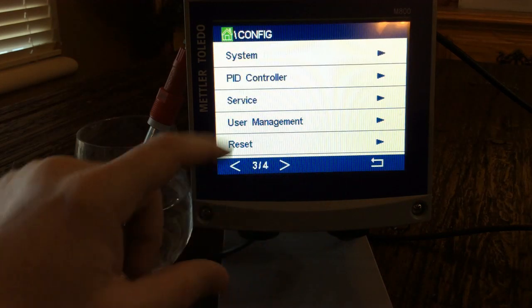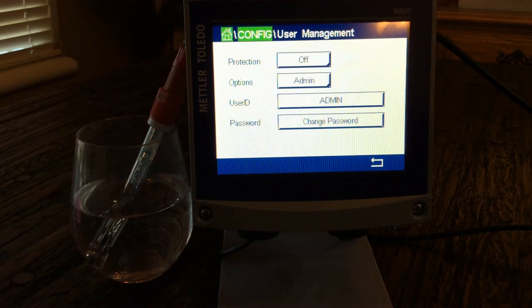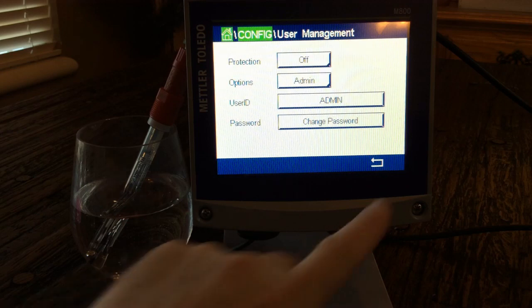Pretty easy to set up. User management is always worth noting — it is password protected if you want it to be. You can set a password so only certain people can go in and make changes, which helps safeguard the system from unwanted adjustments to outputs and other settings.